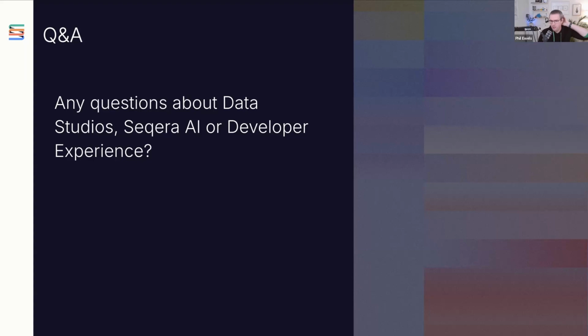There's a good question here, Sasha, for you. How does the Seqera AI know which test samples to run the test workflow on? How does it know which data to use? Yeah, that's a great question. So this is kind of building on top of a lot of what is in the test data sets repository. Each of those samples has a generated description. And so we use the large context windows to select the most appropriate sample based on the context of the question answered and the process in which it's being run. Very cool.